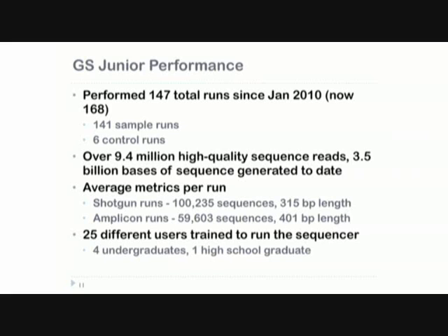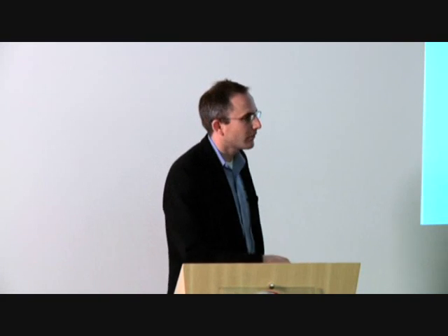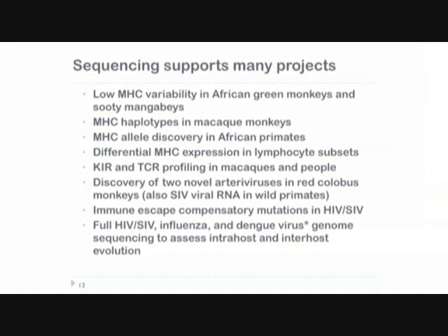We've been able to study HIV and SIV evolution within short regions, which allow us to look at things like drug resistance, which I'll talk about, and immune escape.